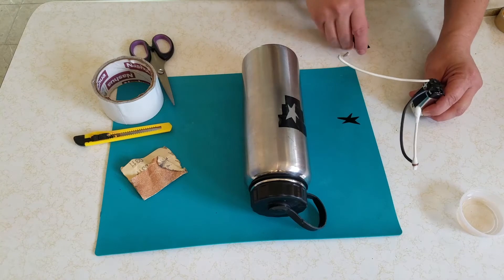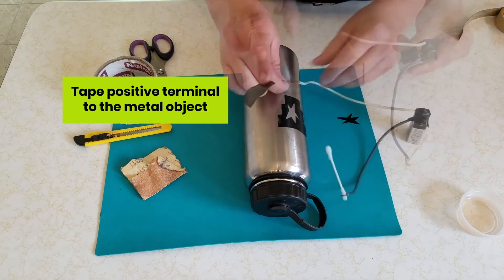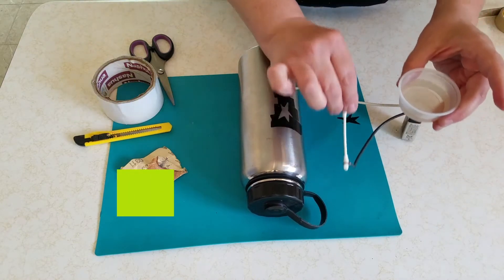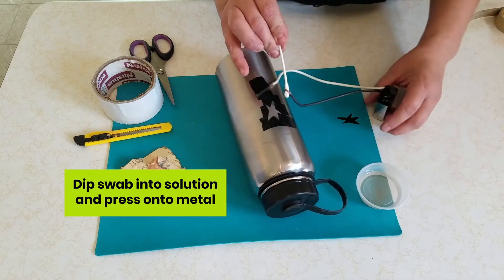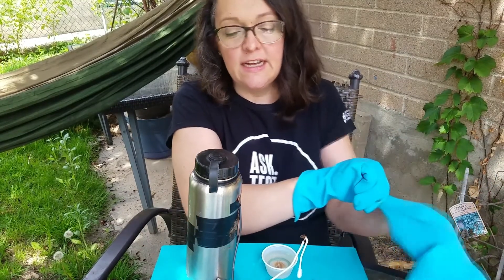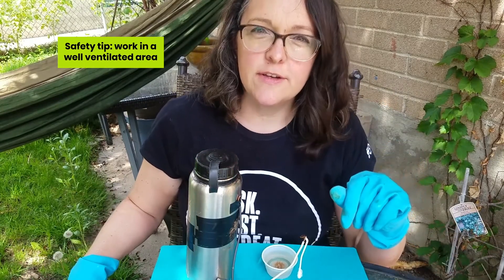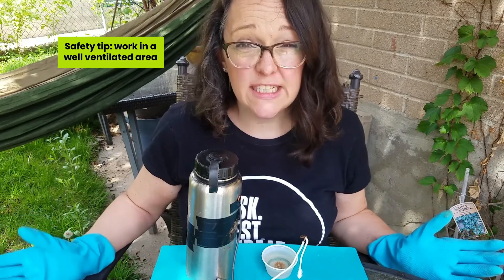To get ready for etching, we're going to take the wire connected to our positive terminal and tape it to our metal object. Then we're ready to start dipping our swab into our solution and pressing it to our metal object. I brought my etching outside because as I started to do it, I noticed a faint smell of chlorine, and that's not really safe to inhale. So I've decided it's safer to do this in a well-ventilated area.